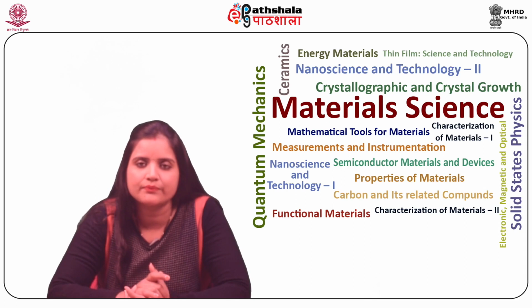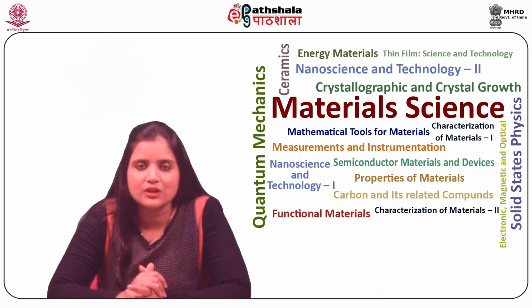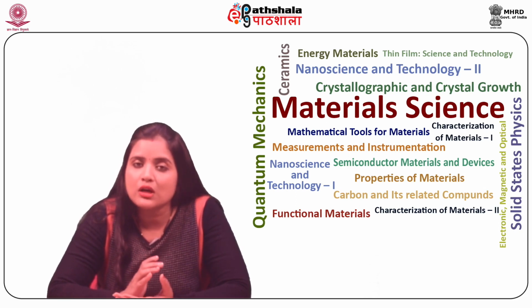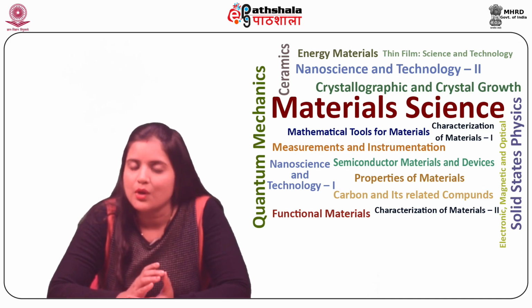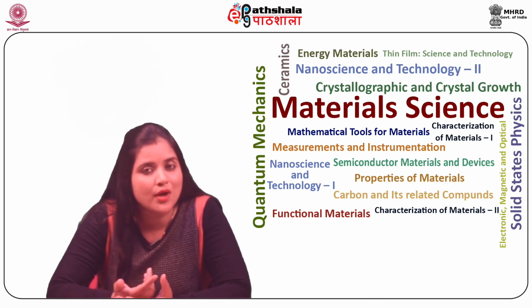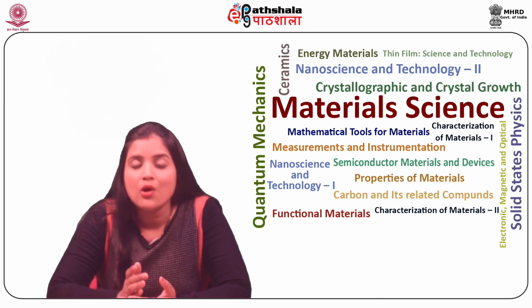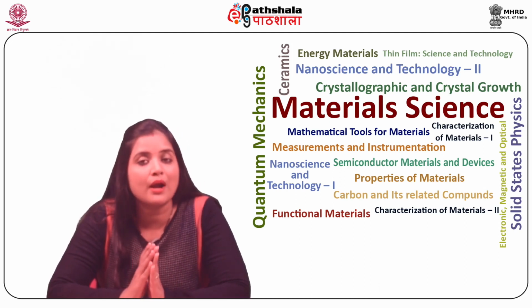Due to the limited instrumental techniques of his time, Synge's vision would have to wait for over 50 years. With techniques developed for the scanning tunneling microscope, Dieter Pohl et al. developed the scanning near field optical microscope, also known as SNOM or NSOM, in 1984, whose resolution goes well beyond the Abbe barrier.